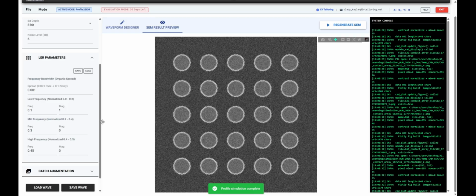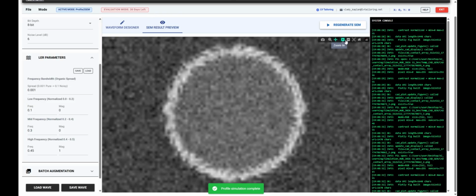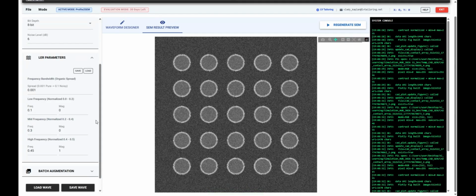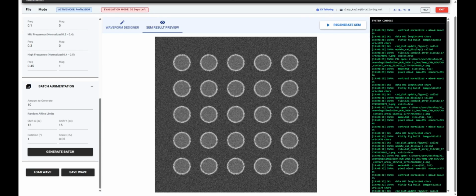The absolute certainty of the underlying structural dimensions removes the ambiguity traditionally caused by unpredictable optics. As a result, research teams can safely test the absolute limits of their contour extraction and Fourier analysis tools using perfectly characterized datasets. Even when maximum organic spread and severe SNR penalties are applied, the fundamental baseline architecture remains a known, quantifiable absolute. This transforms the simulator from a mere visualization tool into a formidable primary reference standard for cross-system verification.